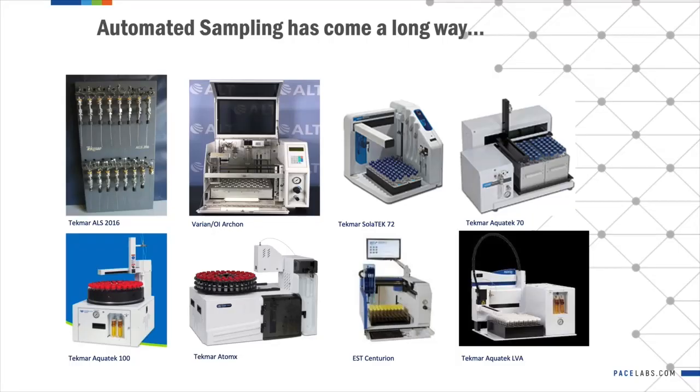As you can see from this slide, automated sampling has come a long ways from where it was even a few decades ago. Even with just a few pictures, you can see a lot of progress. We even still have a few of these older samplers in our network today. I know I've worked on a lot of Archons over my time in this industry.